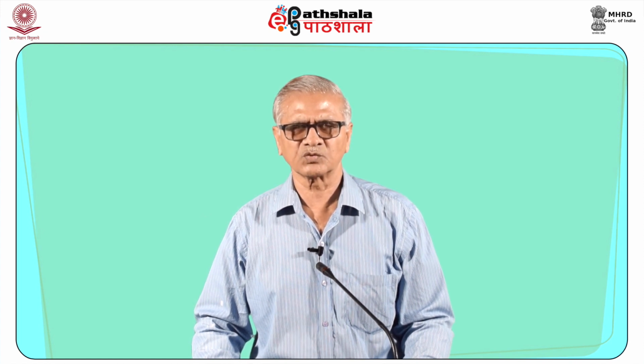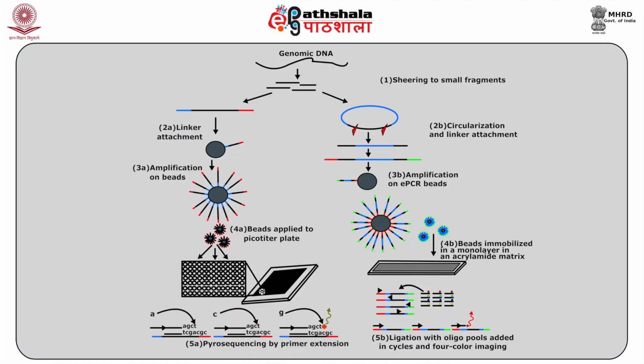Addition of one or more nucleotides generates a light signal that is recorded by the CCD camera in the instrument. This technique is based on sequencing by synthesis and is called pyrosequencing. The signal strength is proportional to the number of nucleotides, but is linear only up to 8 consecutive nucleotides, after which the signal falls off rapidly. The figure explains the comparison of pyrosequencing and Polony sequencing.